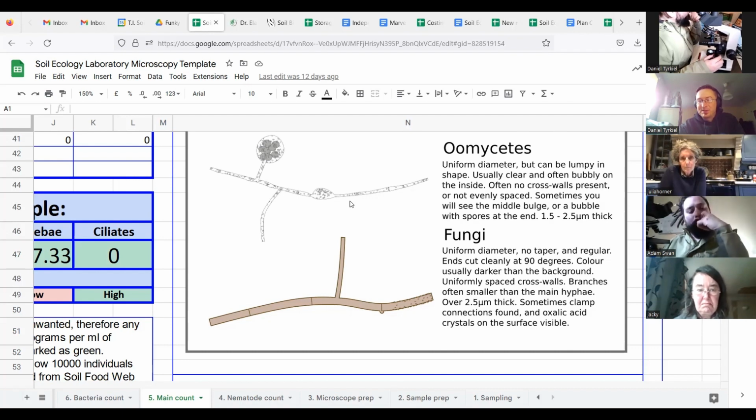But the thing that throws us off, and this is where the pushback comes from as well, is that beneficial fungi can look like this, and also not so beneficial fungi could look like this. So the main pushback is from the fact that all young fungal hyphae will look closer to this. You can take wine cap mushrooms, which we use all the time and they're very beneficial.